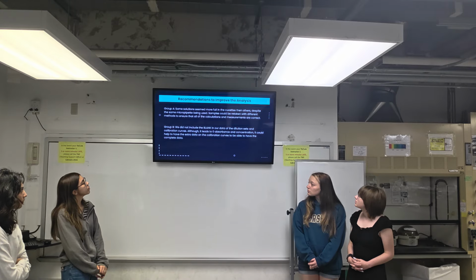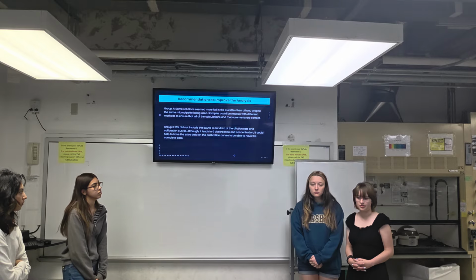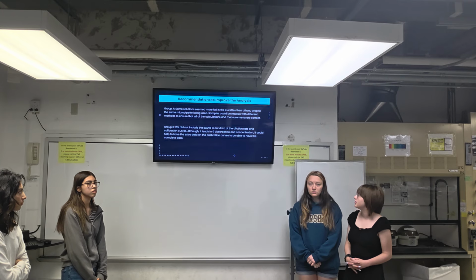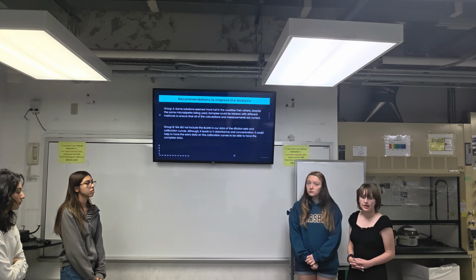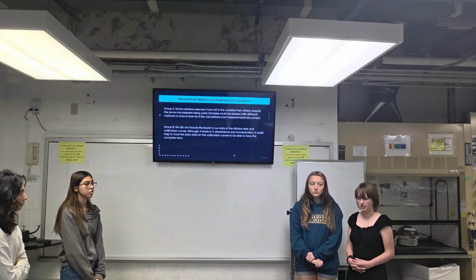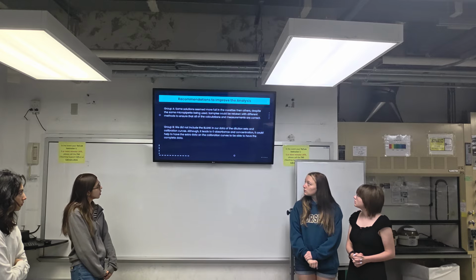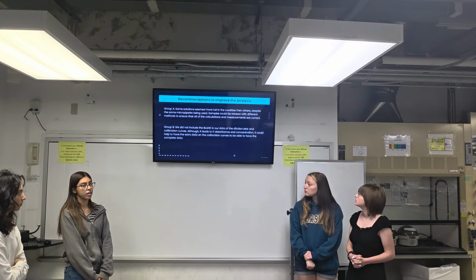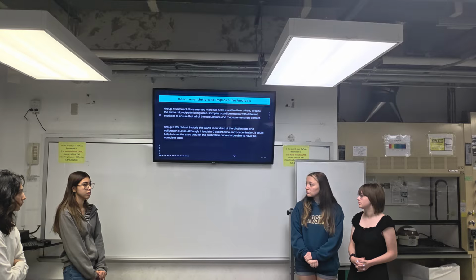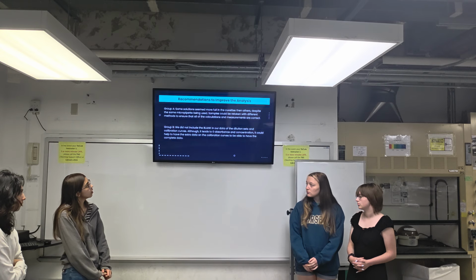And then recommendations. For our group, some of our solutions seemed more full in the cuvettes, which may have been a problem with the micropipette, and we could just redo those samples to make sure that they were correct, and that might have been the reason for some of the data being off. For us, we didn't include the blank, so the water.